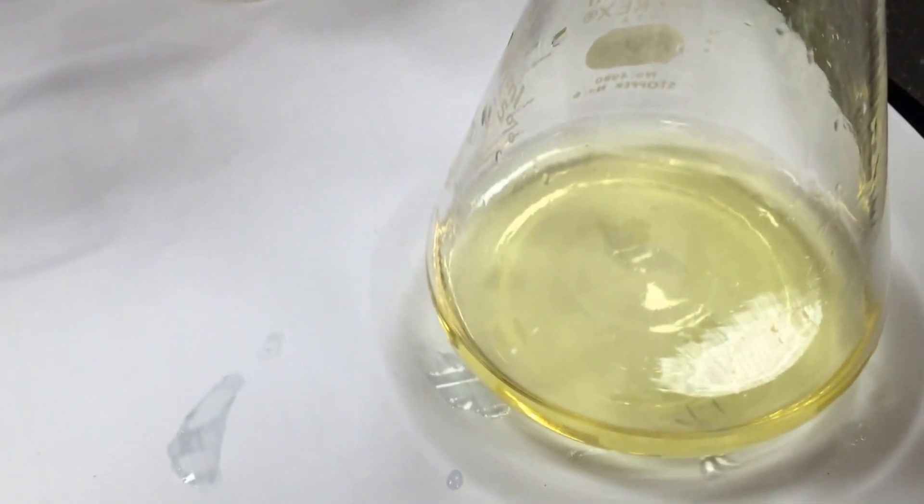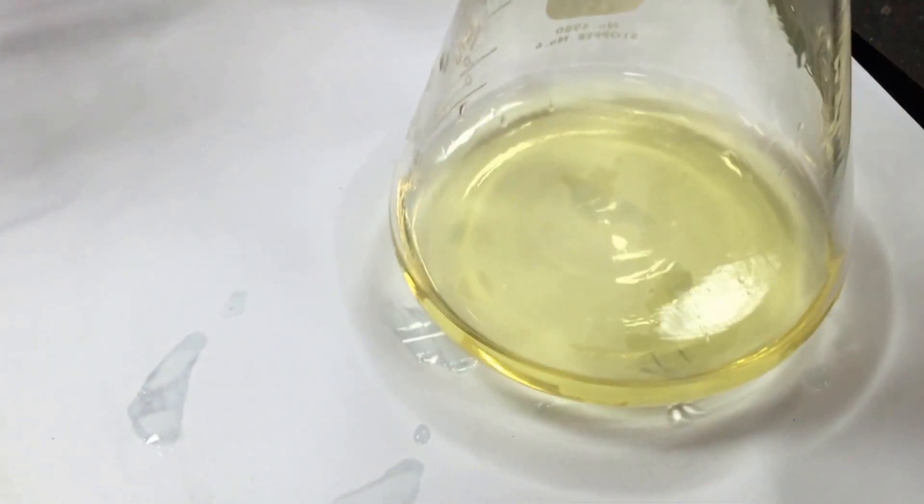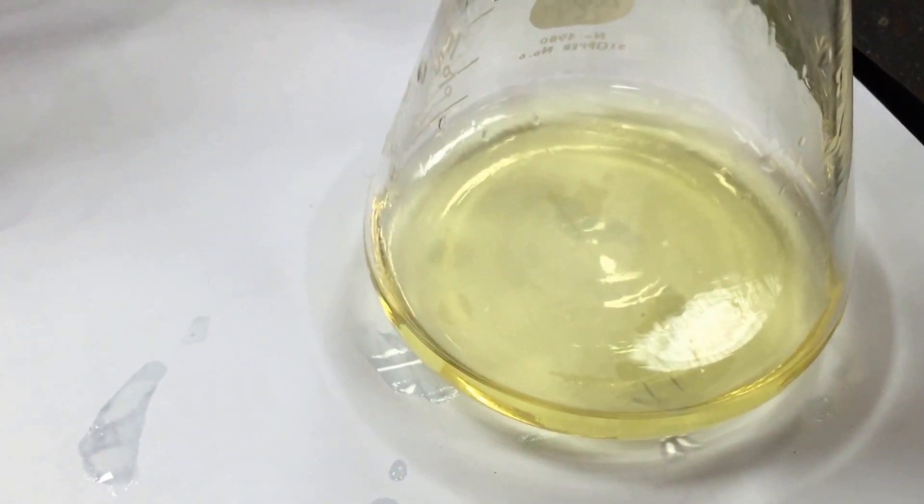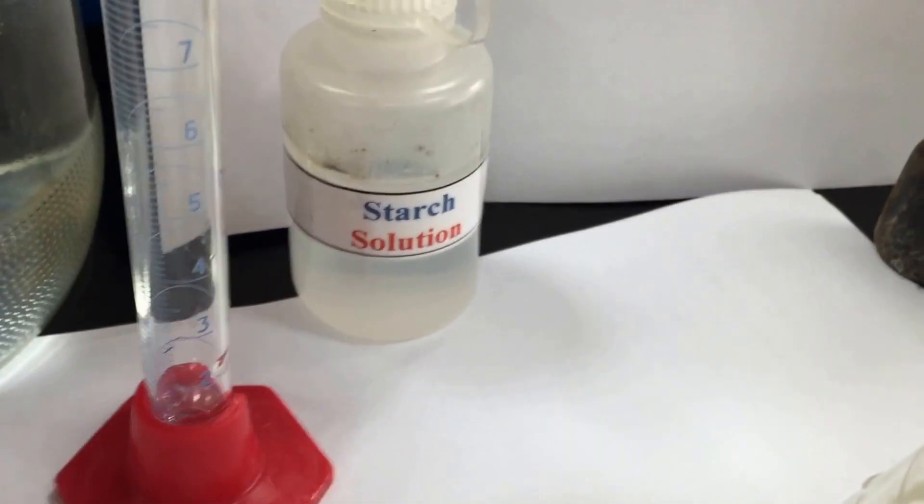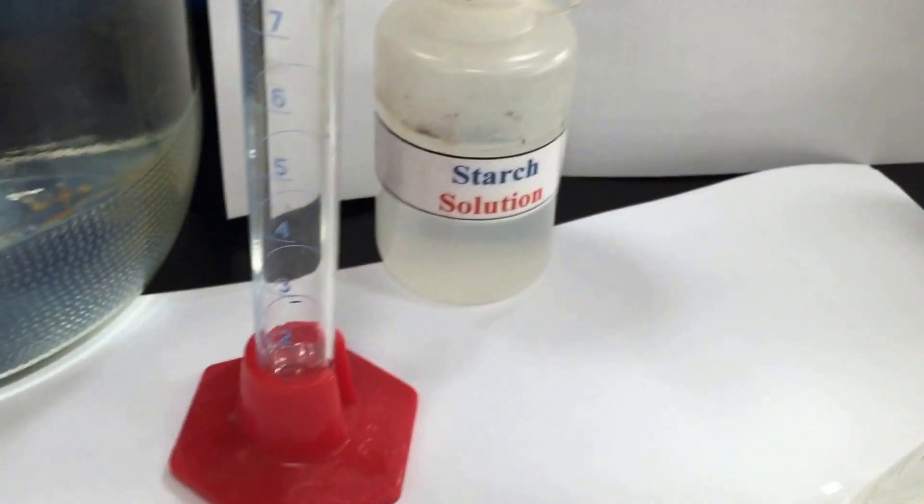So we're going to wait. We're going to first titrate most of the way until this becomes mostly colorless. Then we will add the starch solution, which I've already measured out. It's just about one milliliter or so, approximately.